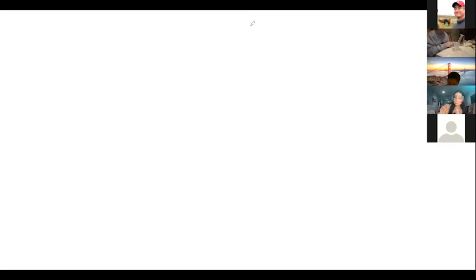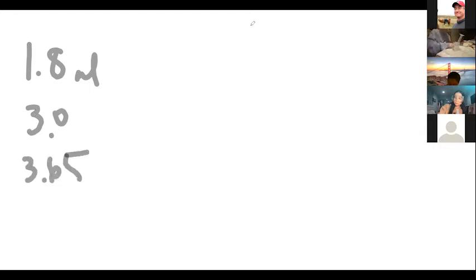So I did 4 reactions, and so I have 1.8 mils, 3.0, 3.65, and 5.60. So that was the amount of H2O2 I had. So we need to convert that to moles. So how do we do that?